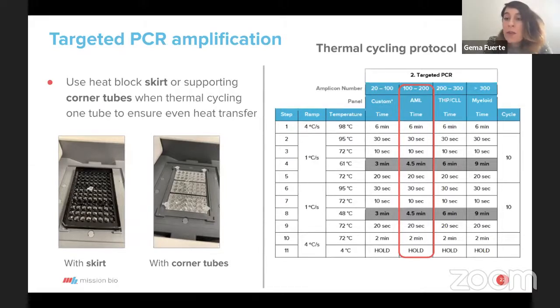We have found that different thermocycler brands have different ways to set up the ramp rate. So we have to check if people want to do a multi-sample workflow and they need to run 3 thermocyclers at the same time. Ideally, we want the thermocyclers to be the same, but that's obviously not possible sometimes. So they have different brands. If they have different brands, we will spend a little bit of time talking to the vendors and making sure that the programs really tally. So the programs have to take the same time, and they have to have the same ramp rate.